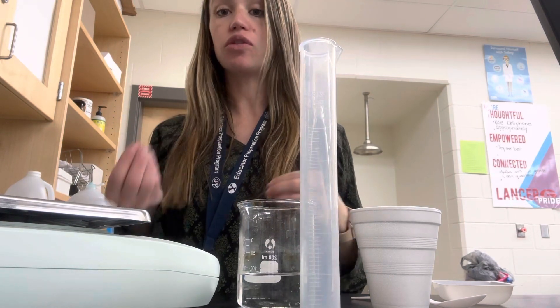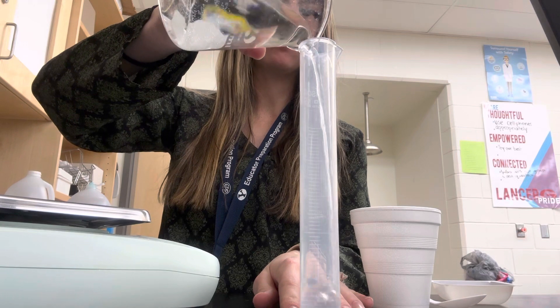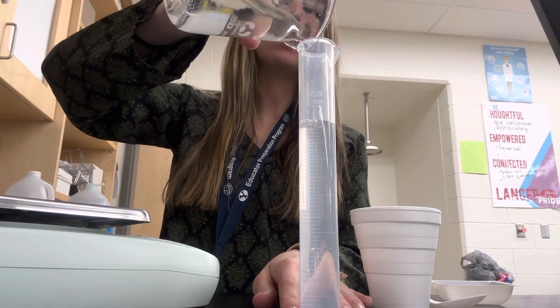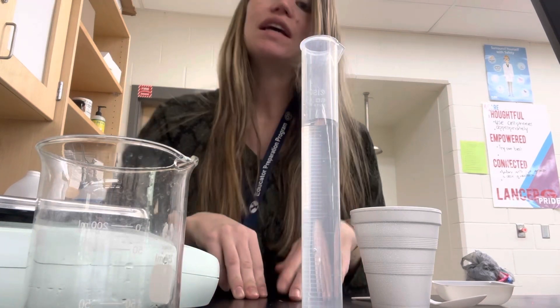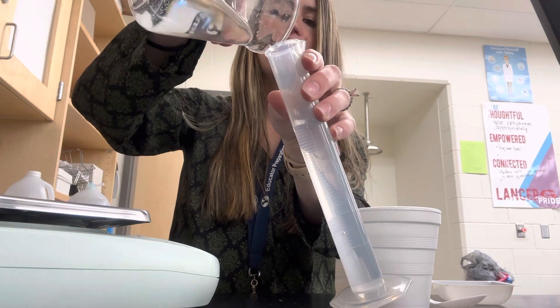Your first step is to measure out the water for the reaction. Get water from the sink and fill up a graduated cylinder until you get to 50 milliliters. Remember to be at eye level with it — bend down and check if it's at 50. If not, add a little bit more until you get to exactly 50. Alright, let me do that.